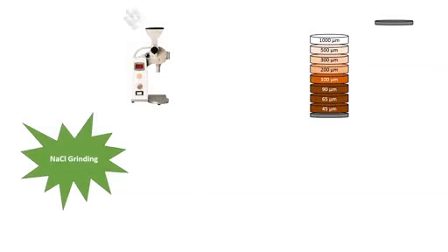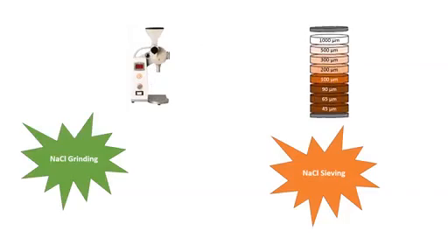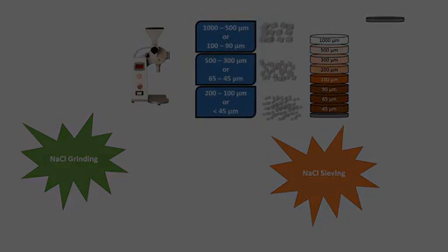Sodium chloride was ground in a laboratory blender for 20 minutes. Thereafter, sodium chloride was dried on a heater at 100 degrees C prior to sieving in a sieving machine.